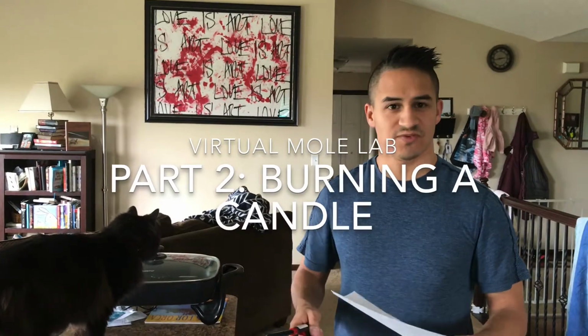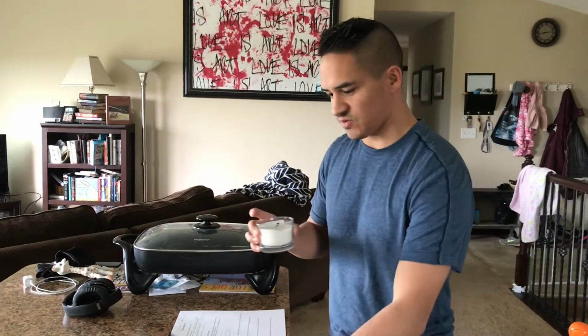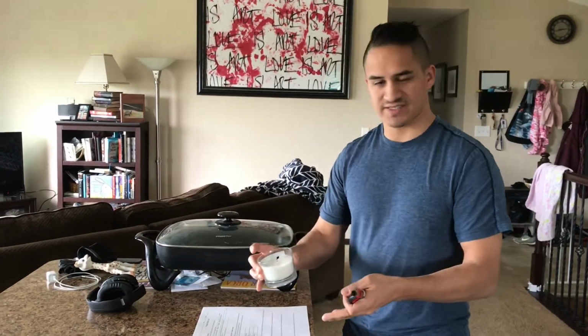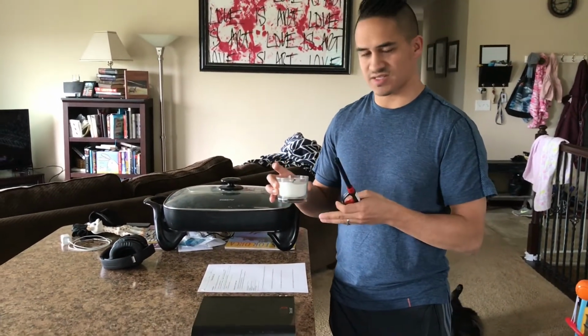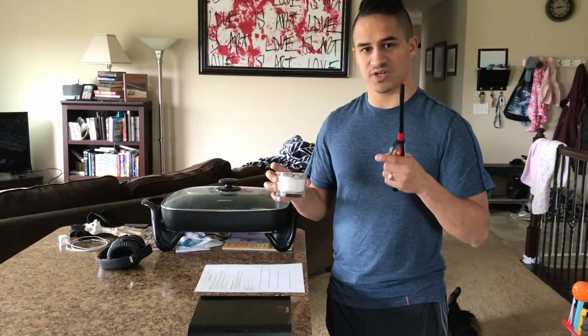So this is part of the virtual mole lab. And in this part of the lab, we are going to be calculating how many moles of wax are burned from this candle. Okay, so what we're going to do first is put this candle on my fancy little food scale here, and see what the mass of this candle is before we do any burning. So on your lab handout, this is something you're going to have to write down.